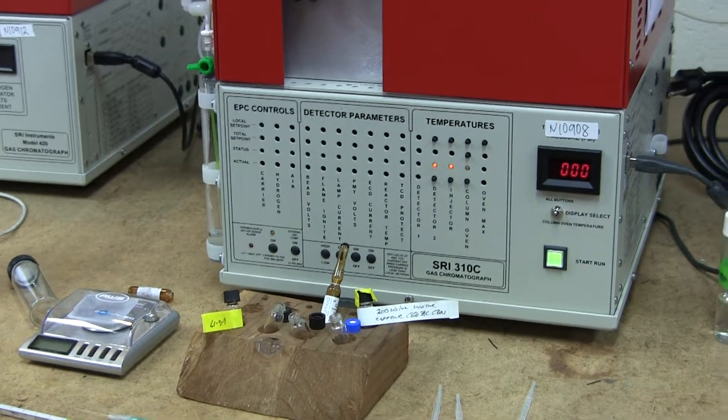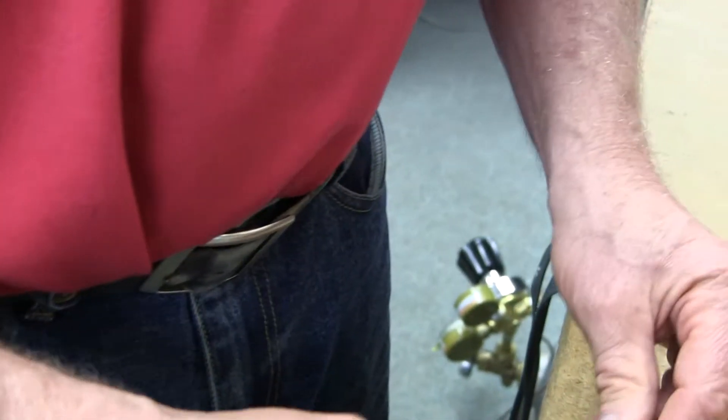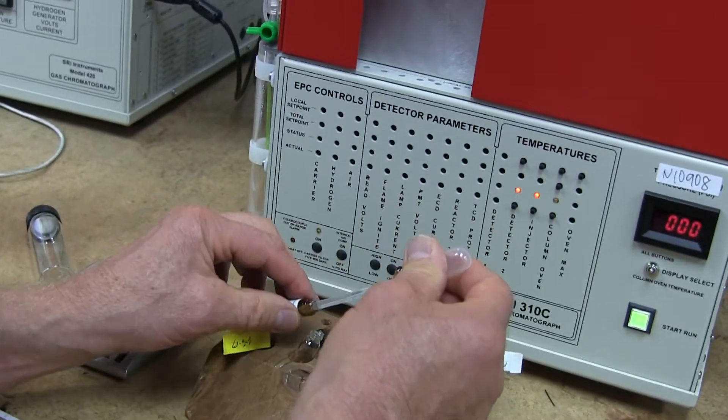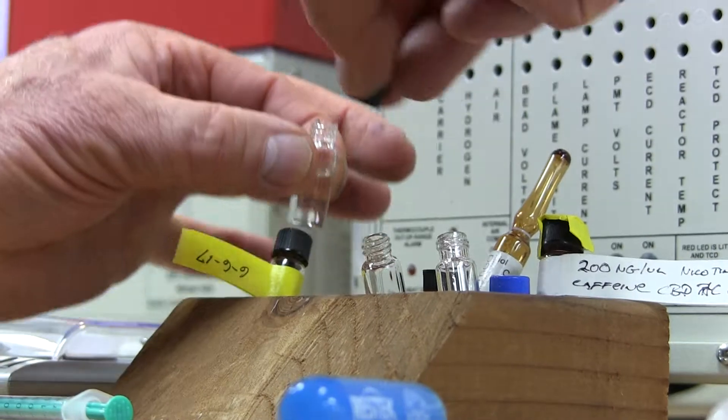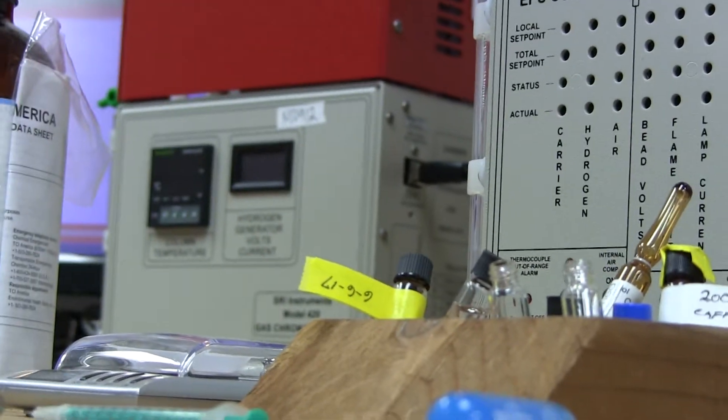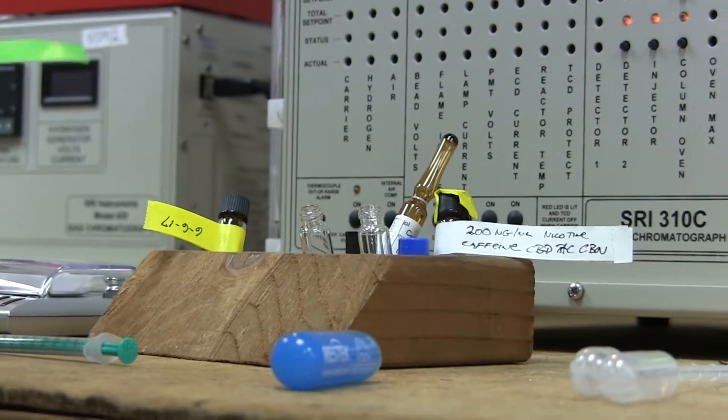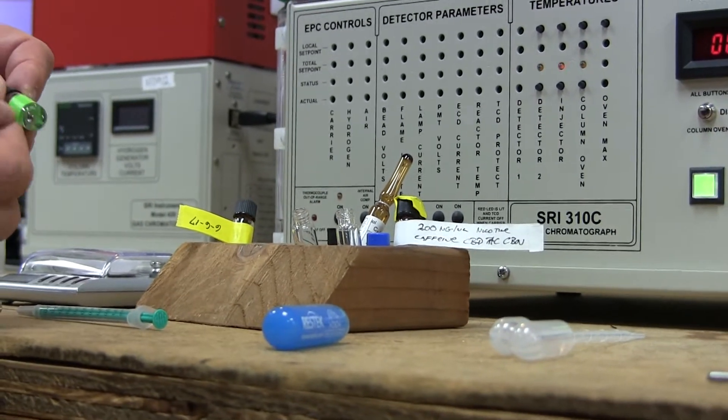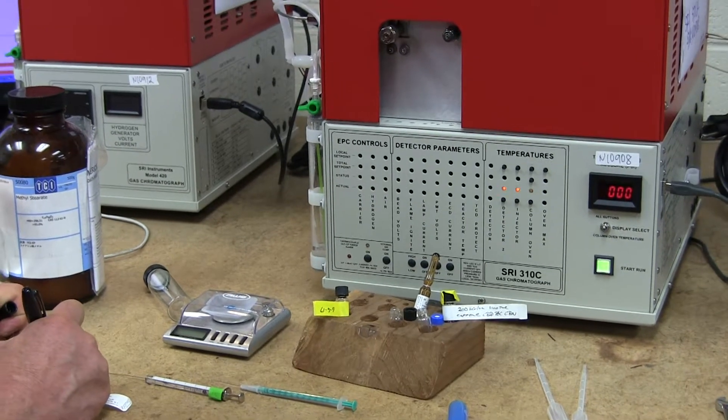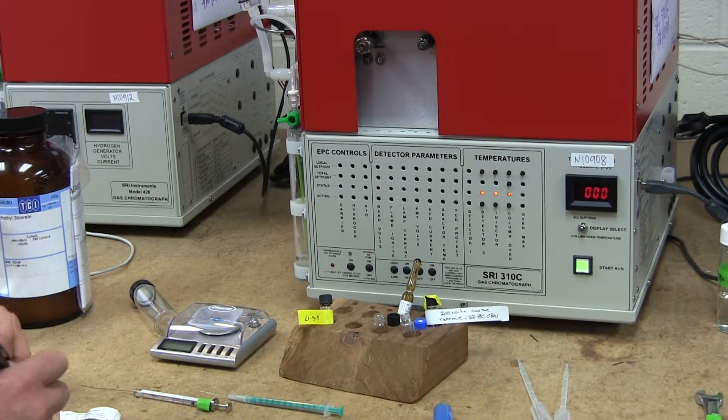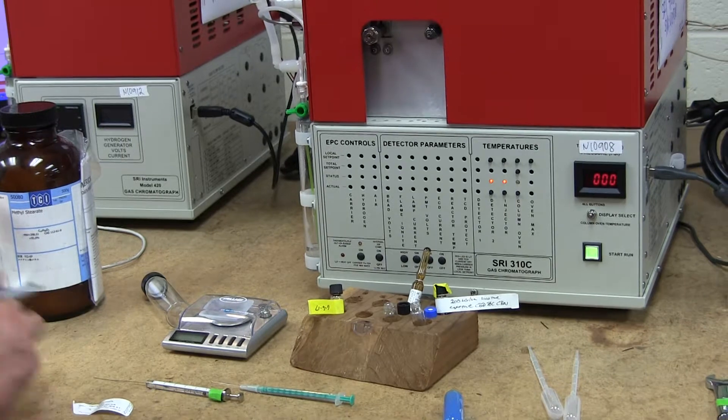So we'll go ahead and do the same thing for the THC. This is the Delta 9 THC. Snap it off. Take a nice clean disposable pipette. Transfer that into the 1 mil bottle. Throw these glass bottles away. Cap the little bottle. Make a label. And so this is 1,000 nanograms per microliter of Delta 9 THC. And I took it out of the bottle today and it's 6-6-17.